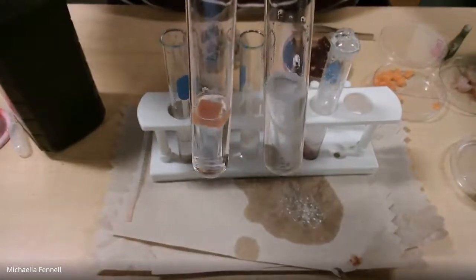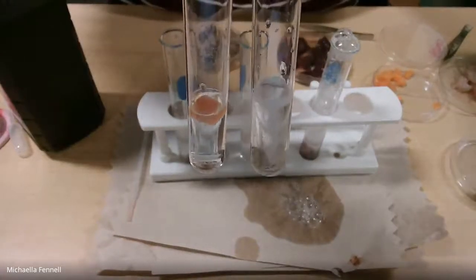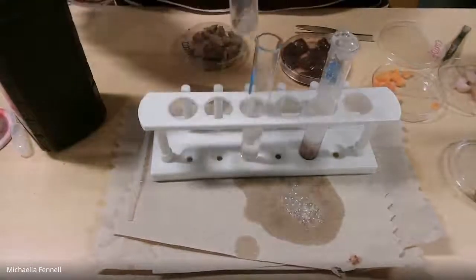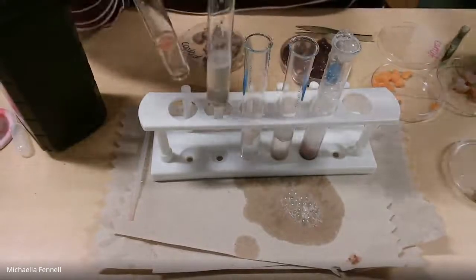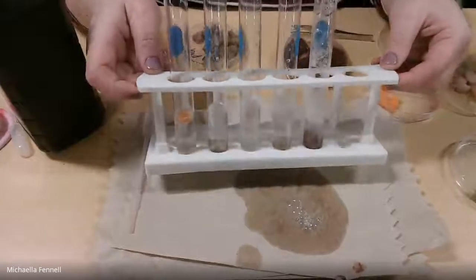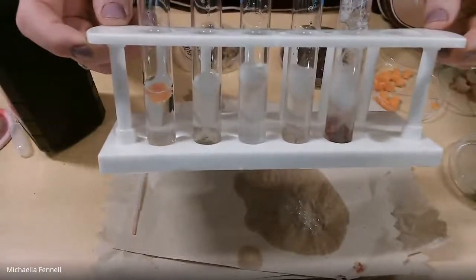Maybe the cooked liver has a little bit more going on than the carrot. I'd say cooked liver is 4 and carrot is 5. Let's put these in order again. So I say raw liver, potato, chicken, cooked liver, carrot, in order from 1 to 5. You can see all the results. That raw liver is still going. Isn't that funny? All right.